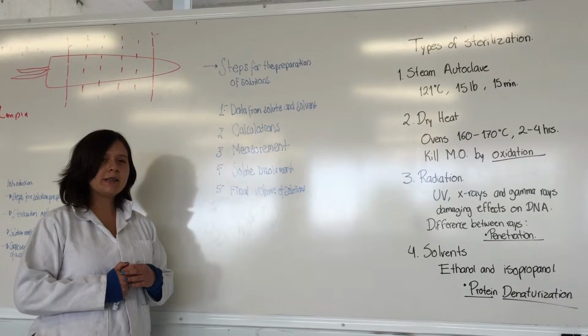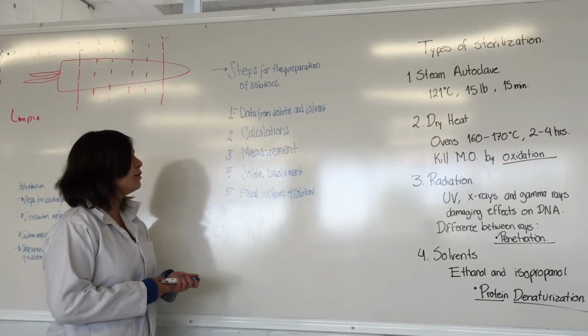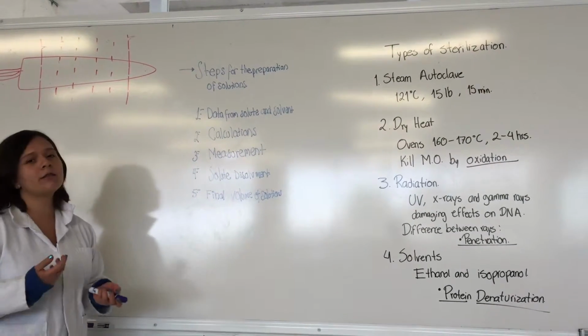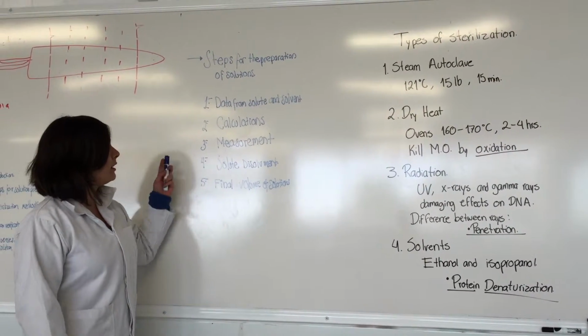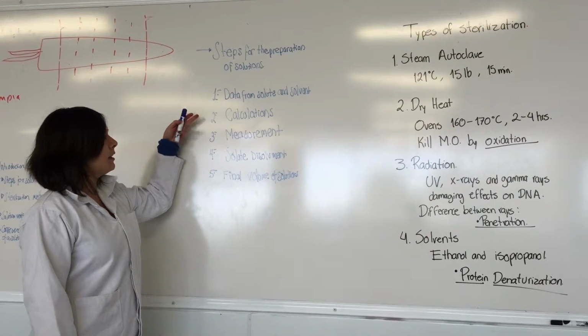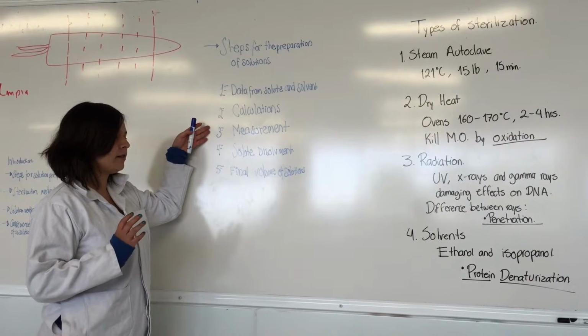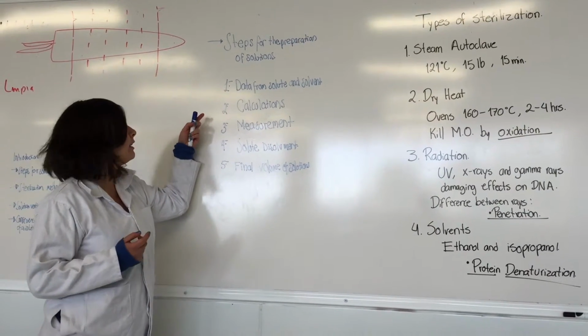The objective of this practice was to make solutions. In order to make the solutions, we follow certain steps. First, we need the data of the solute and the solvent to make the correct calculations, and then we will measure the quantities that we obtain in the calculations.